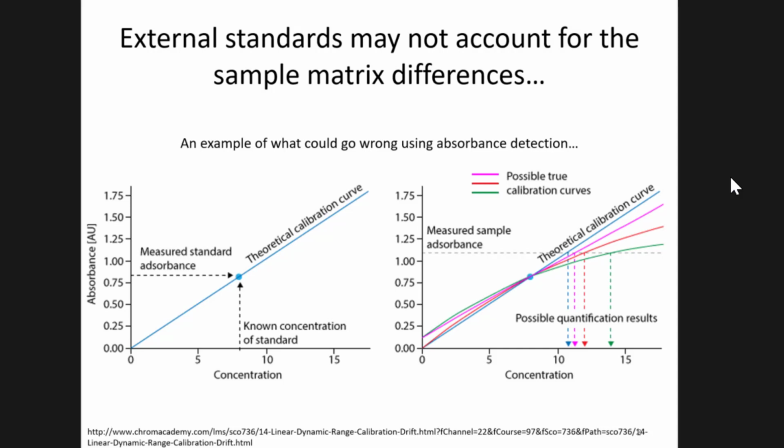So here, this is just looking at ideally what we would want to see, and this is an example from spectrophotometry again, absorbance versus concentration. You see a straight line, you measure the absorbance, you bring it to the line, you calculate concentration. So we apply similar principles, except with mass spectrometry, we're looking at signal intensity or peak area ratio.